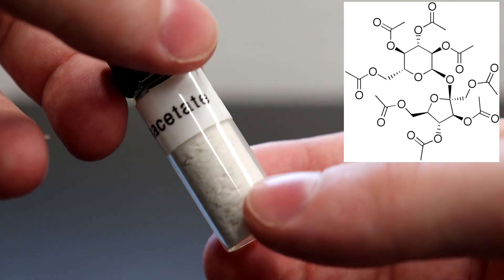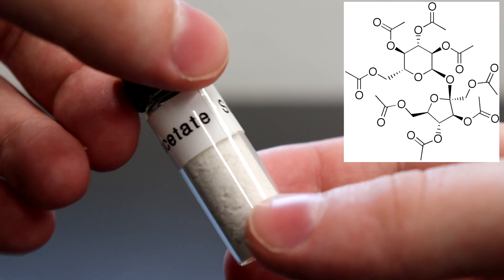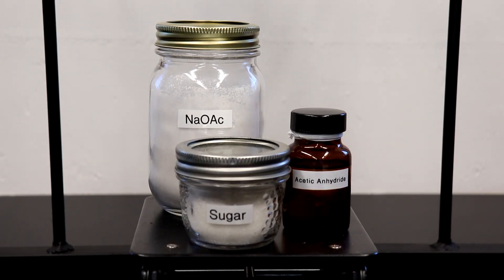In this video, we are going to be making the very bitter compound sucrose octa-acetate. This synthesis requires 2 grams of sucrose, which is just common table sugar, 1 gram of anhydrous sodium acetate, which is acting as our catalyst during this reaction, and 10 milliliters of acetic anhydride.